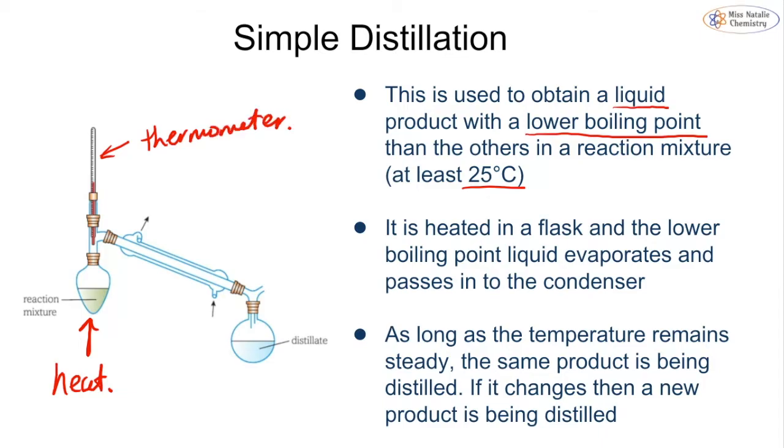And we have our mixture getting to the point where something is going to boil off, or whichever of our products, and the vapours are going to travel, and they're going to go down through the centre of the condenser. Of course, we know that this is going to be filled with cold water. That is going to cause it to turn back into a liquid, and then it can be collected in a round bottom flask, and we call this the distillate.